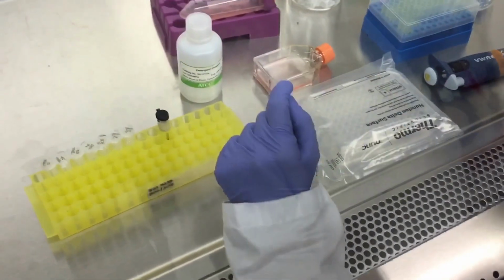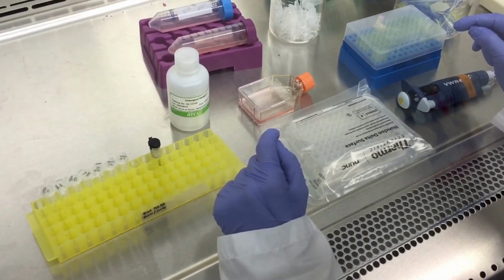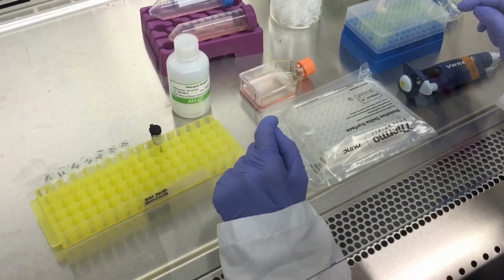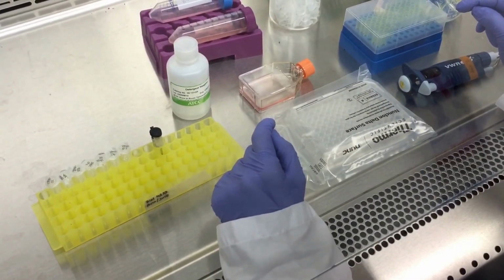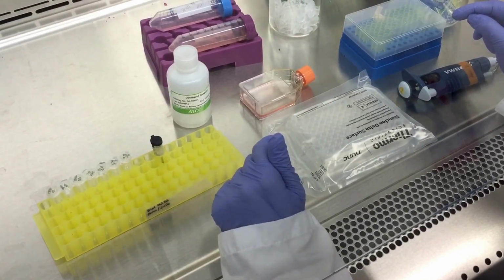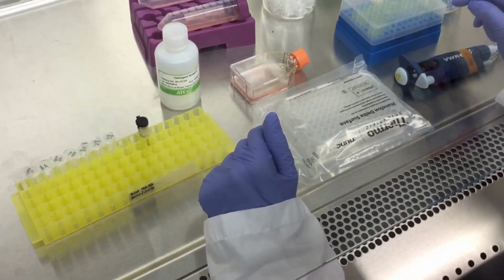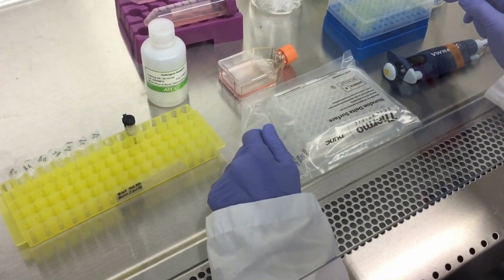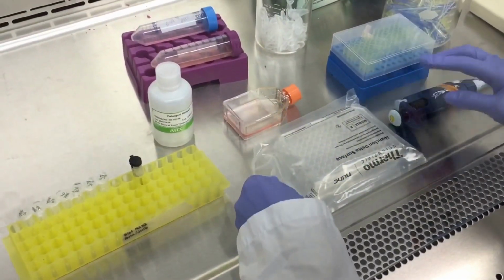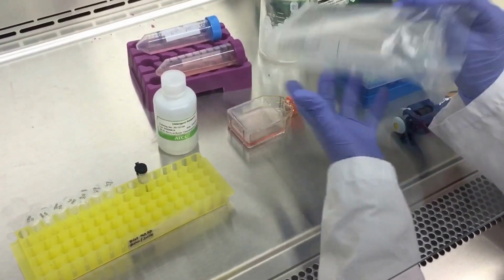Okay. First, you would need to count your cells in the hemocytometer, and after you get your cell count, you find out how many cells you need to plate. For us, our optimal number is 50,000 cells per 100 microliters, and we counted 100,000 per 100 microliters. So today we're going to put in 50 microliters of cells into each well. And we have done the calculations, and we'll need around 2 ml of cells.